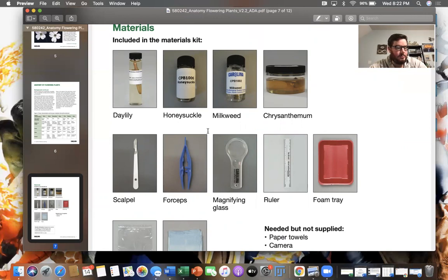In the box, you should have been provided forceps, a scalpel with a cap, and scissors, which aren't used to cut necessarily. They're used to spread in dissection. There's also a wooden stick that isn't on your list. That's what I had in mind. And a bunch of dissection pins, so you can use these to pin down the aspects of what you're dissecting.